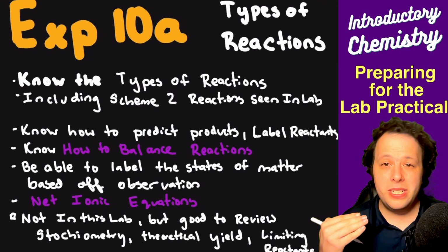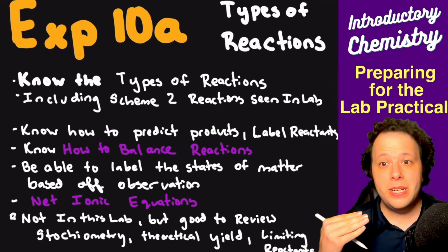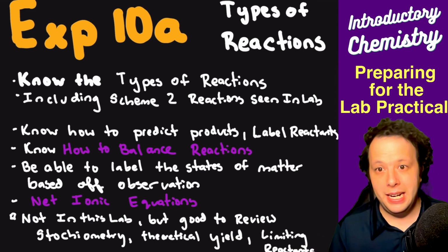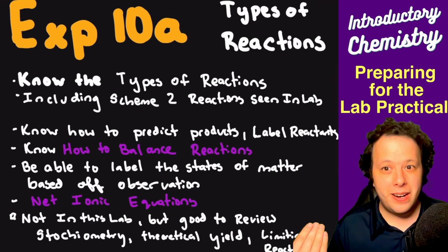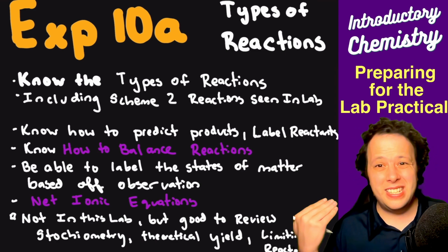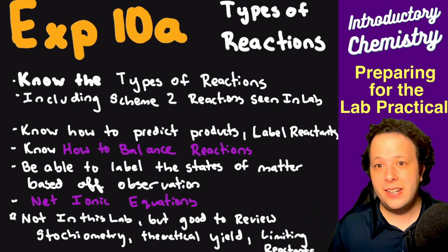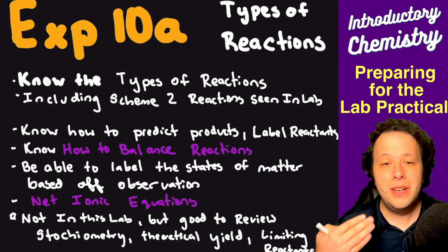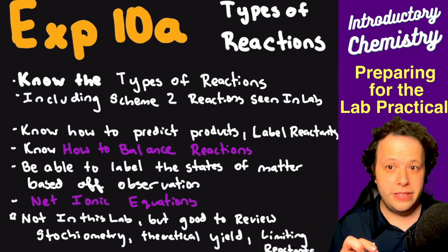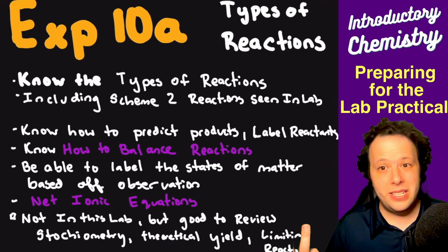The next one was types of reactions. Experiment 10A was a very, very intensive data workup lab. It was really fun going around mixing things together for about an hour. But the one thing you notice is that the data workup for this took hours. You had to write all these net ionic equations, predict all these reactions, and balance all of them. But there were skills that you need for this class, right? You're using them all the time in stoichiometry. So you still use them and it doesn't go away.